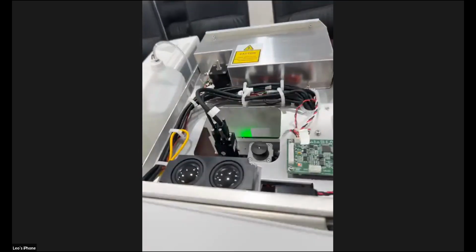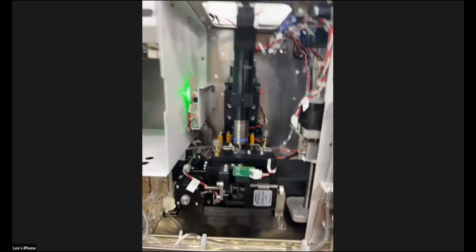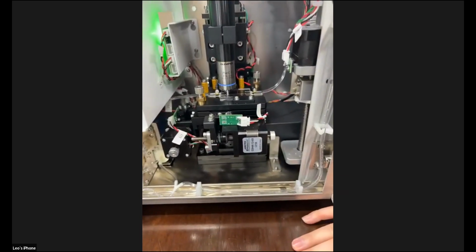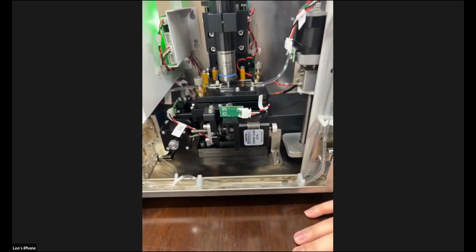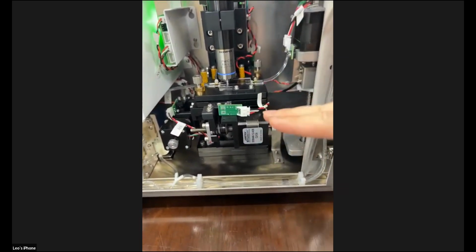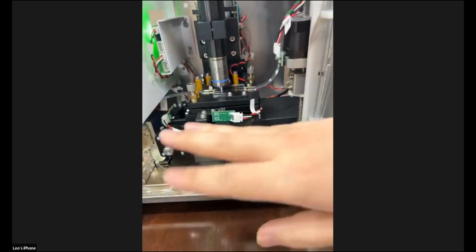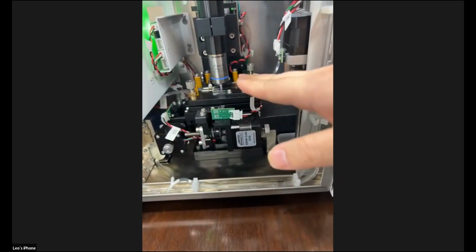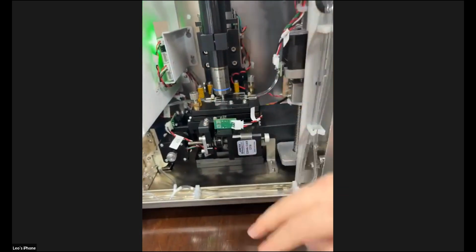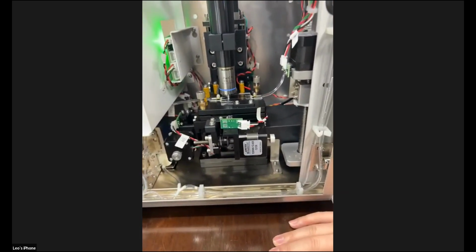Okay, so continuing from the left side, you can see that the microscope module is more similar to the 1000 plus, almost the same, because it has three axes, x axis, y axis, and z axis to control the platform, to control the distance between the platform and the microscope, so that we can get a better picture and a better result.